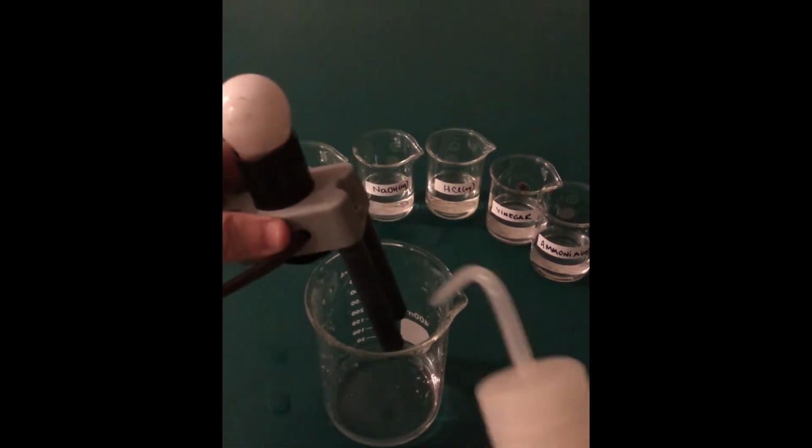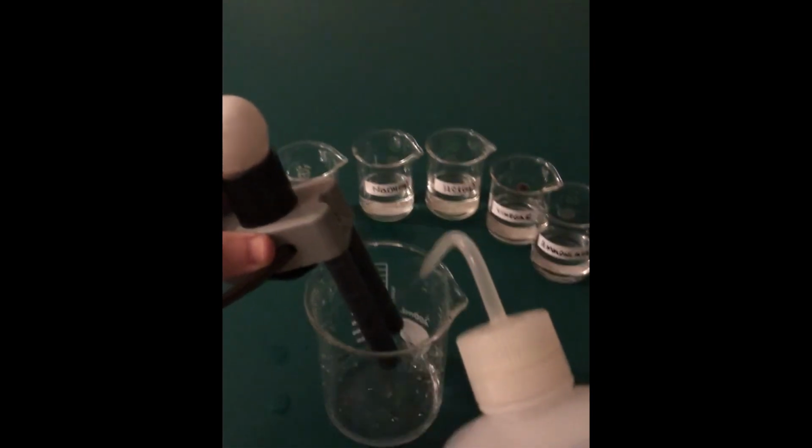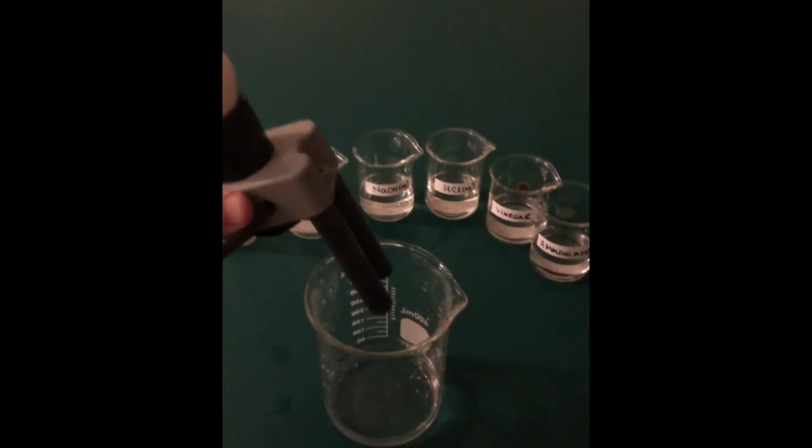So what I'm going to do is I'm going to test other things here. In between tests, of course, we want to clean the electrodes. So I'm going to rinse them out here. All right, there we go. And so I'm going to be doing that in between each test.